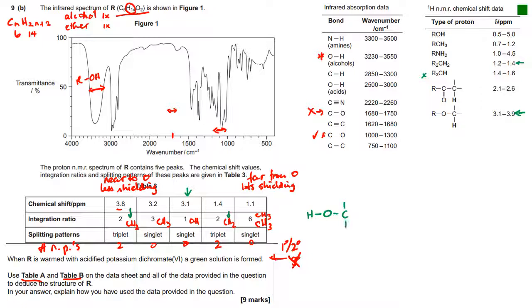So now we can say that we have these two CH2 groups connected to the oxygen. We've dealt with this CH2 group, let's give it a tick there. And we've dealt with this CH2 group, and we've dealt with that OH there. Okay, moving on. Let's do our two CH3 groups here.